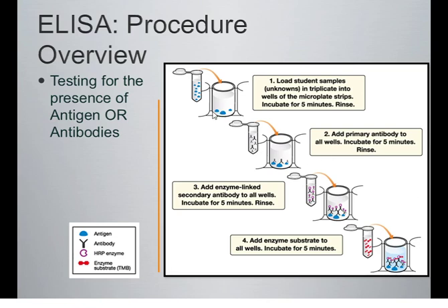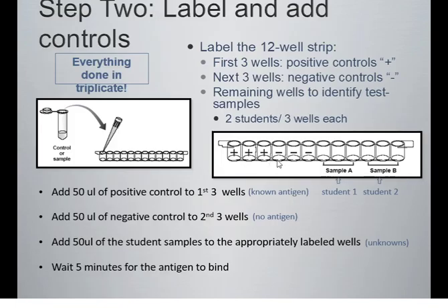And so whether it is the actual protein or if there's nothing in there at all, you have to make sure that between this step and the next step, you have this detergent that comes in and fills any of the space, right? For your negative controls, you typically don't have anything in there. And so you have to make sure that the detergent binds to the bottom of the wells. Otherwise, when you put the primary antibodies in there, they'll attach to the bottom and it will show up as a positive result instead of a negative.